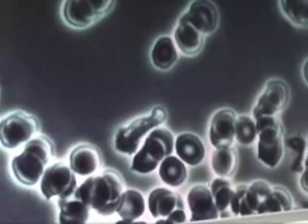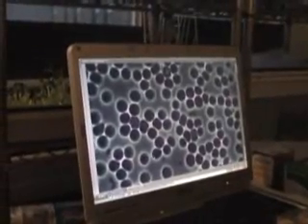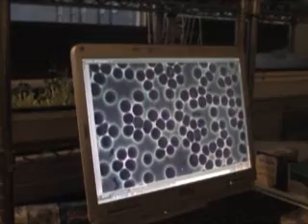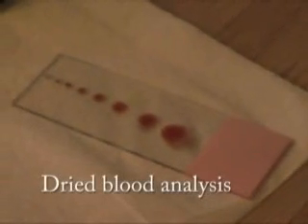You can see everything from strong, robust red blood cells all the way to the little crackety ones that are ready to disintegrate and fall apart, and everything in between. When you have this big size difference — a macrocyte here that's larger than normal and a microcyte that's smaller than normal — that has to do with acidity as well.